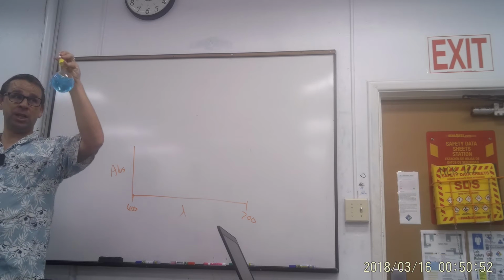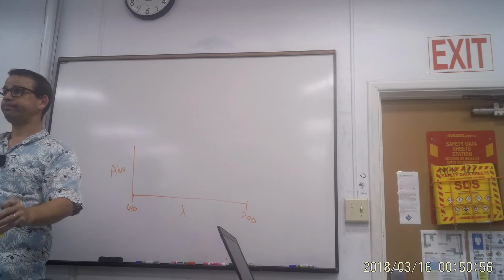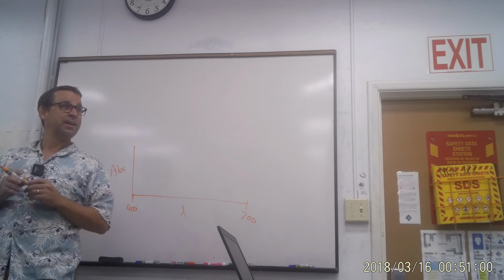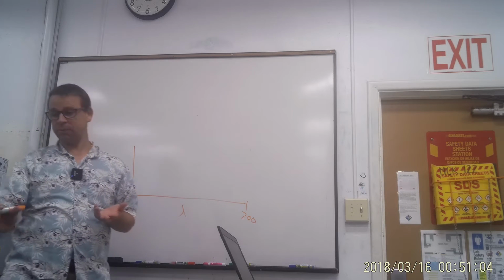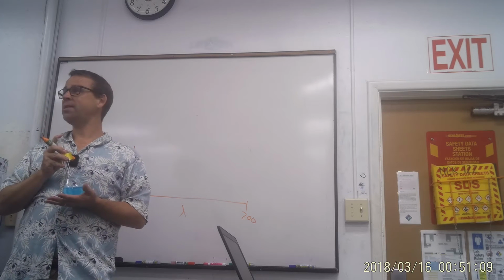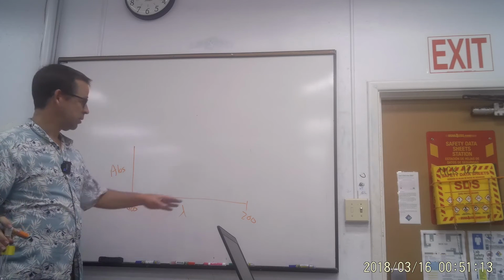I mean, we actually did it in lab. Did anybody remember where the peak was? What's that? 543? I thought we just said that this stuff was going to absorb the red side, right? So that should be down here.